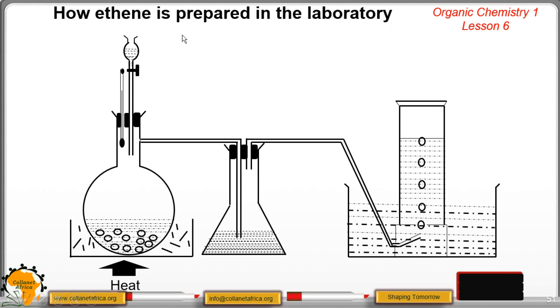In this case, we're going to look at two methods that you can utilize in the preparation of ethene in the laboratory. This is the setup that is being utilized. We have a dropping funnel, then we have a thermometer, a round bottom flask, we have a sand bath, we have the heat, we have the porcelain, and then we have sodium hydroxide, and then the collection of our ethene gas.